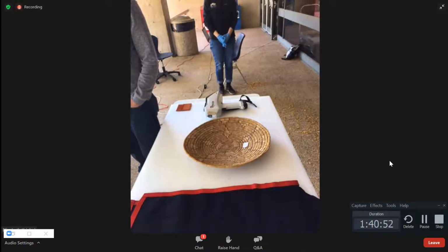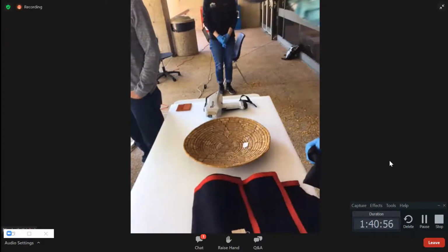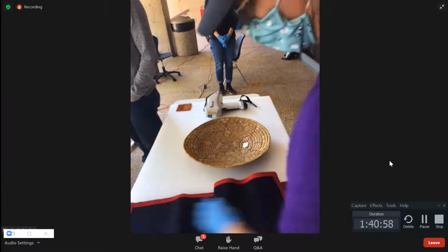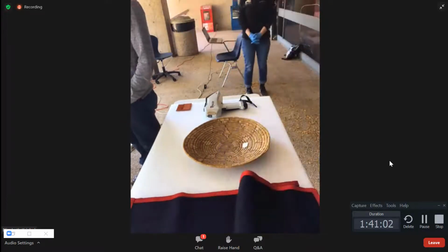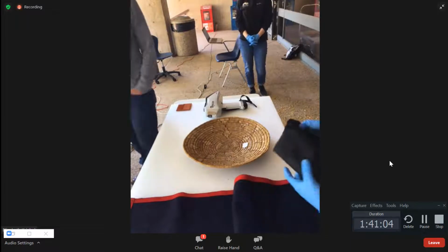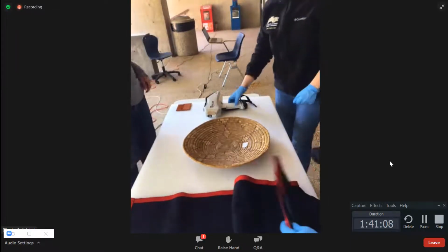These are breeches. And they're felt, and I'm guessing they're fine. They might even be from the 1970s. But we might as well check them because they're felt. And felt seems to be one of those materials that were treated in the past with all kinds of things.